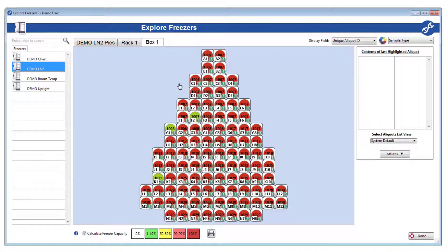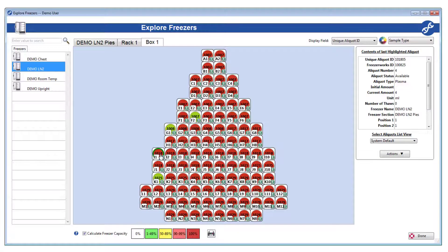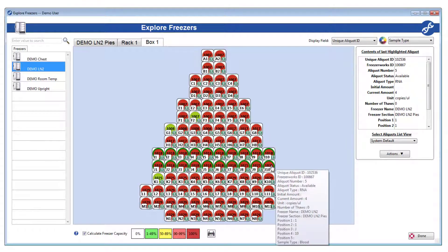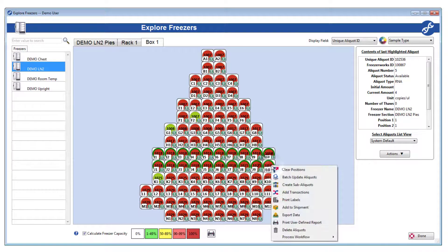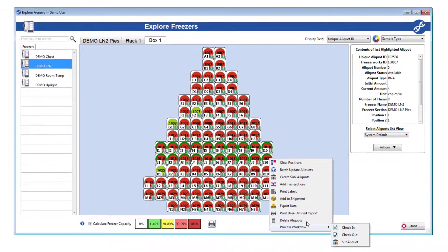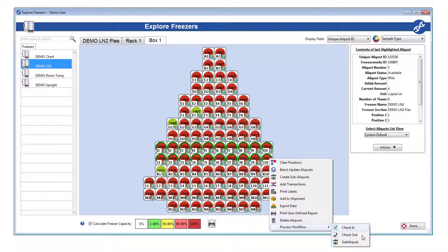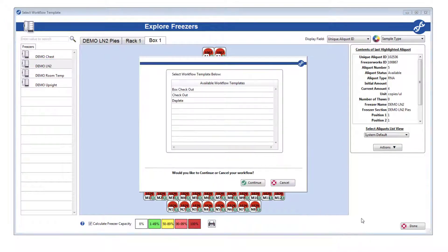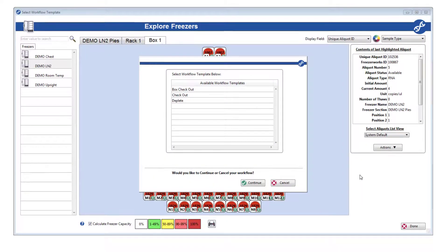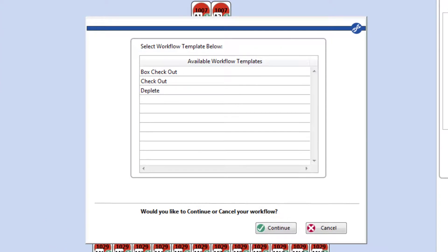Highlight them, then right-click, hover over Process Workflow, and select the type of workflow you want to run. We'll do a checkout, but feel free to try the other types. You'll then see a list of workflow templates that we have created for you. Select one, and click Continue.